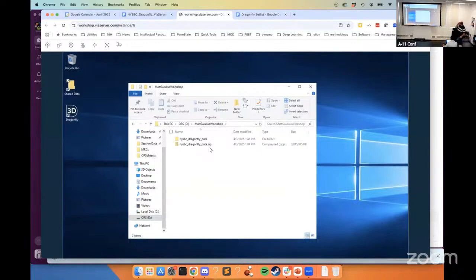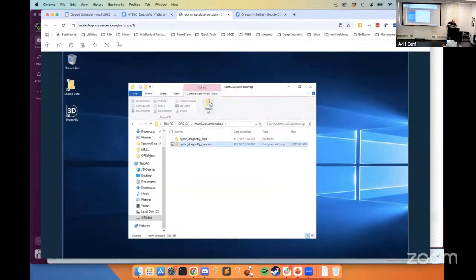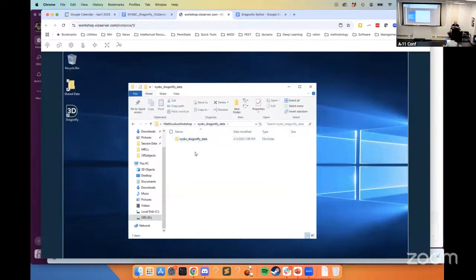All right, so if you just click on that zip, you should be able to hit extract up here, or go to the extract tab and just hit extract all. It's like a 3 gigabyte thing, so it takes like 20 seconds to extract, maybe. Is that working for people? Inside of that folder, there's another folder called NY. It's like multiple folders. Just go inside of those folders until you find macros, models, tomos, and training data.